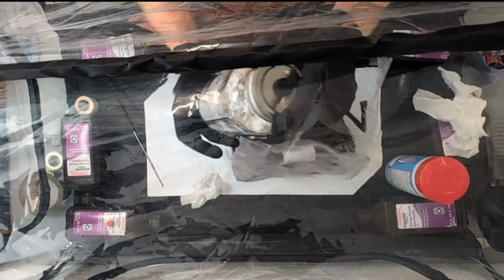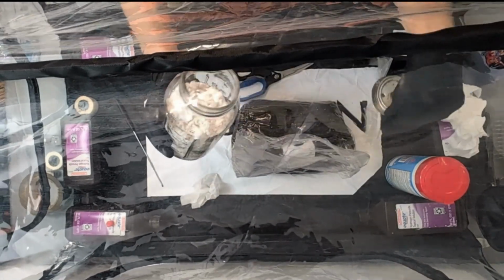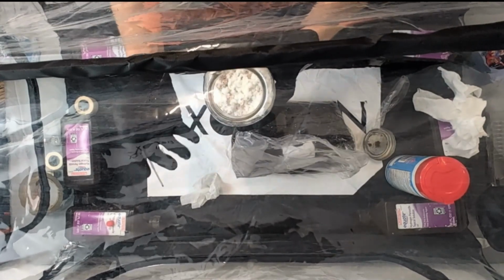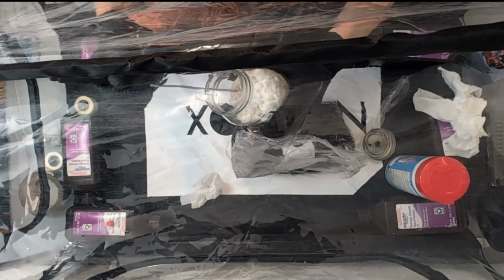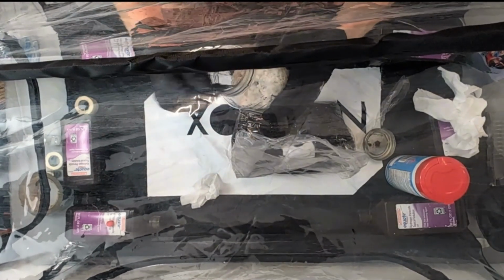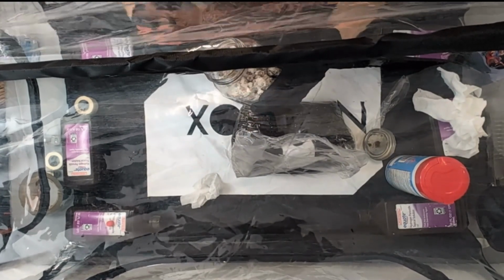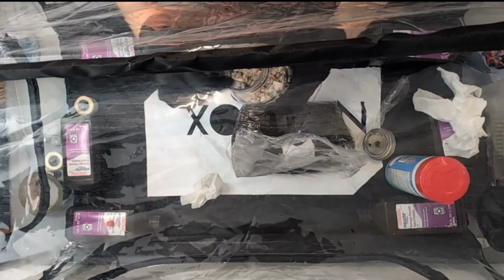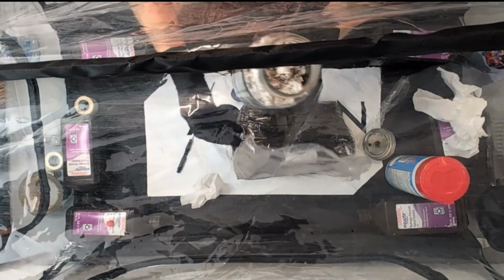This is a fully colonized jar. It is more than ready to go. I can't do my favorite part of this process, which is sticking the mason jar up to my nose and going, oh my god, that smells so good. But that's fine. I typically use a wooden spoon for breaking up the mycelium in the grain jar. This is the first time I've used a screwdriver for it. It definitely seems like the way to go for the future.